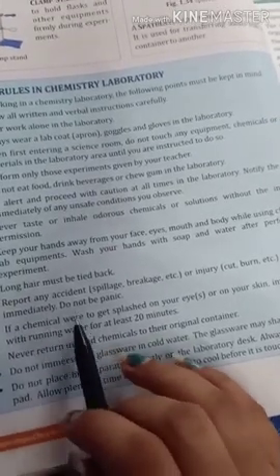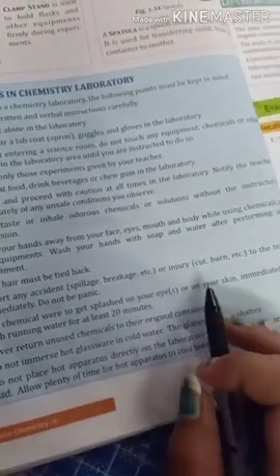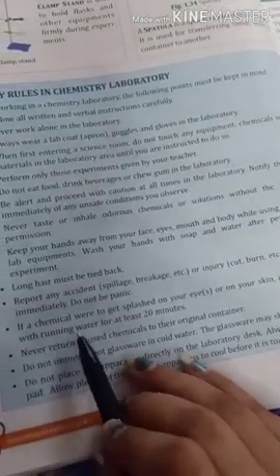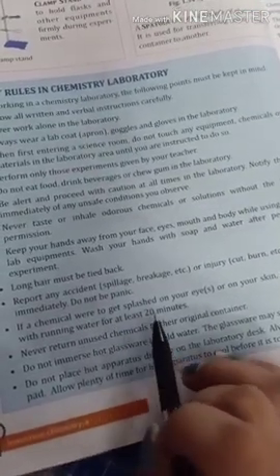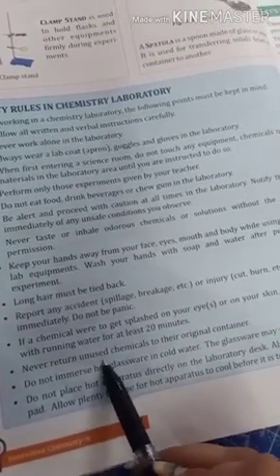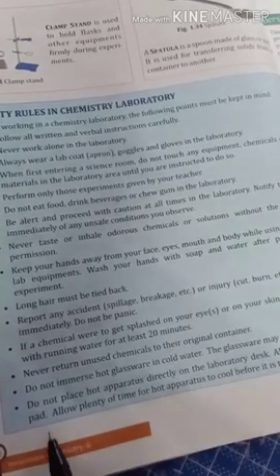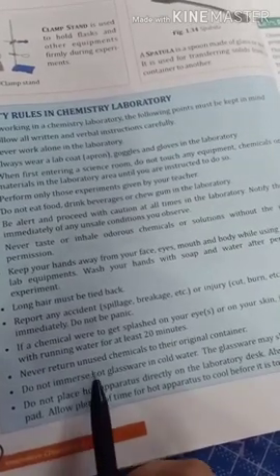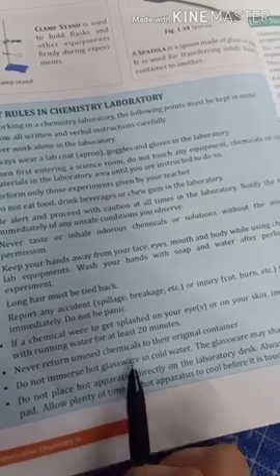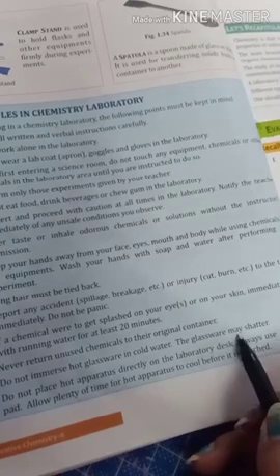If a chemical were to get splashed on your eyes or on your skin, immediately flush with running water for at least 20 minutes. Never return unused chemicals to their original container. Do not immerse hot glassware in cold water. The glassware may shatter.